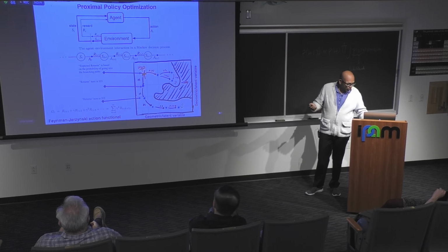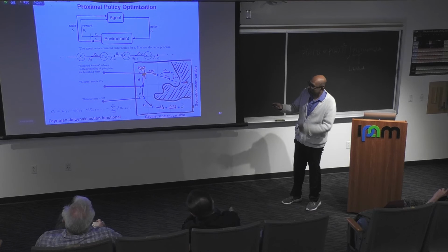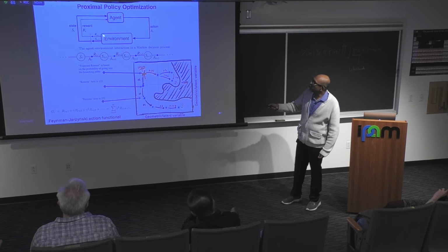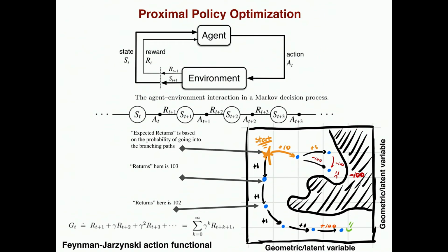Now what we can do is start training a reinforcement learning algorithm. So what's a reinforcement learning algorithm? We have an agent, and that agent moves. After that agent moves, you give that agent a reward. Based on positive or negative reward, the agent learns to make that move or not. So what we have done is said that the reward for the agent is the action function L, the Feynman action function L. So an agent would move only if it goes to lower energy, only if it goes to point B, or it goes to a low force pathway, or a combination of all of that.